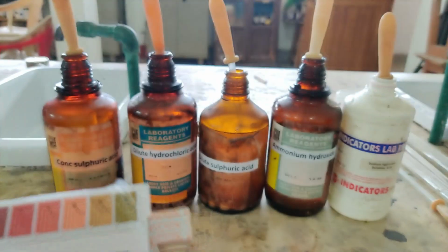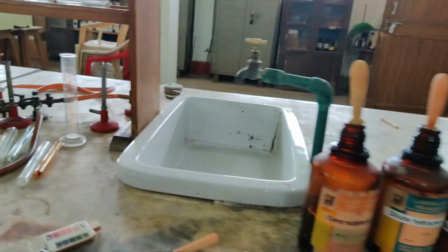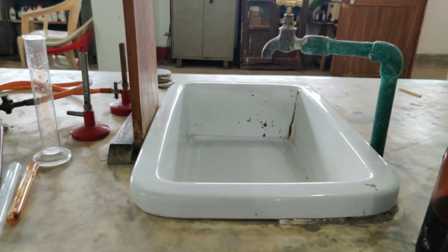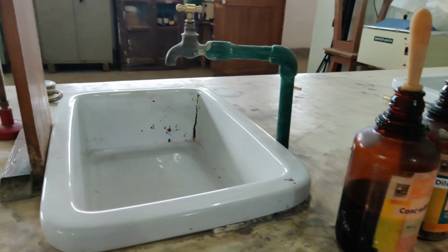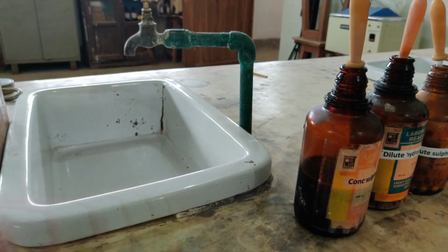Now what I am going to do is test with this strip. Let me go to the basin. I think it will be easy for me to show you. So I am going to the basin, where I am going to use these solutions, and in fact I will show you the solutions also. Since I have 5 solutions, let me take 5 strips.